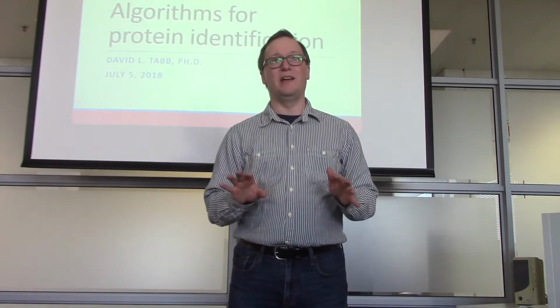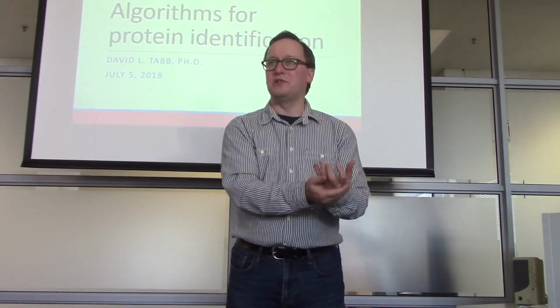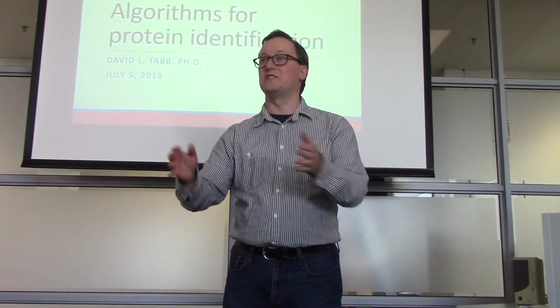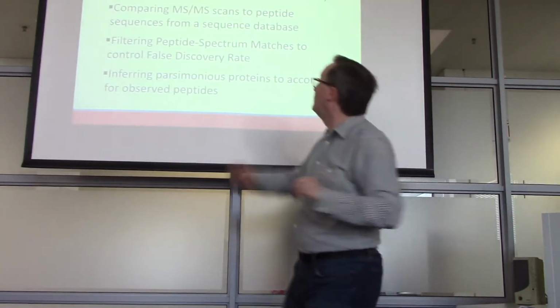So I hope that today we can take you through everything from the start to the finish of how we get mass spectrometry data that tell us what might be in a sample, work it over with different algorithms until we finally get to a protein list that we can actually trust. So just keep on line here and we will move on ahead.